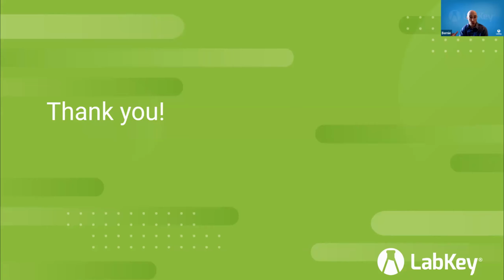It really kind of depends. Others will require you to take manual steps in order to get that data in. Still yet, others will allow you to do some of those actions programmatically, so using code, and kind of everything in between. We'd be happy to talk to you about the way that we do that, but there are a lot of varieties. On the other hand, some of the less sophisticated ELNs simply don't deal with high throughput data. They just don't do it, and so you would need to figure out what you want to do with that high throughput data before it's used in the ELN.